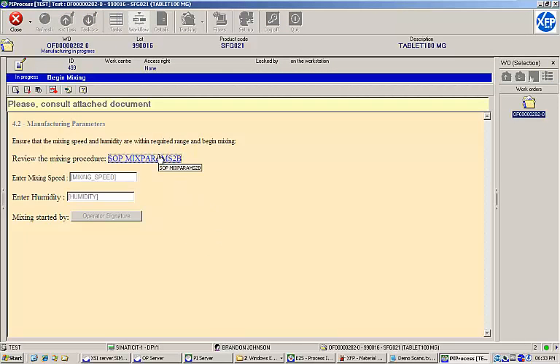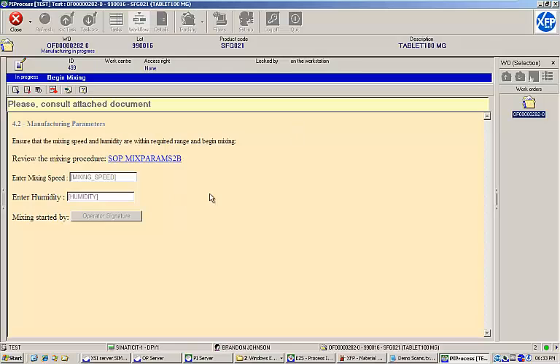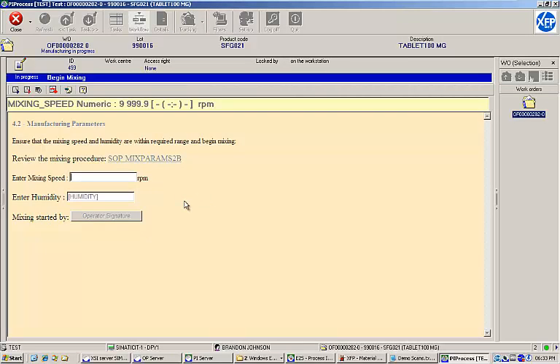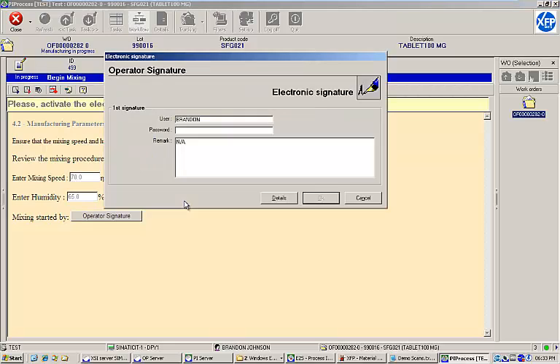First, I'll need to review the mixing procedure. Then I can enter my mixing speed and humidity values and perform a signature.